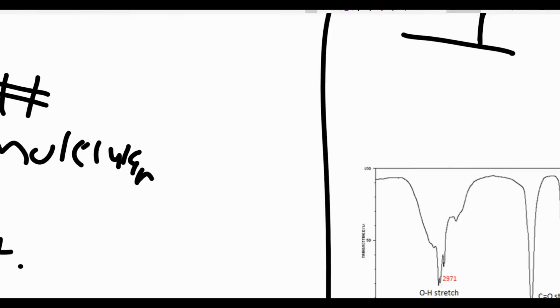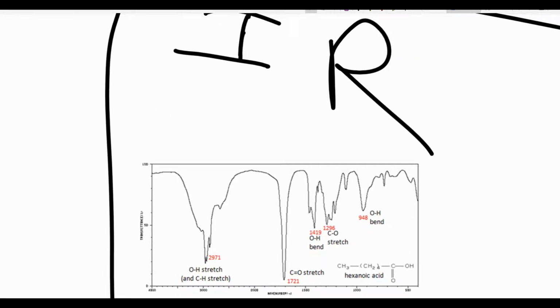Moving on to the next one, IR spectroscopy. This one I rated the ugliest because it's very different from the rest of the graphs. However, it does give you a lot of good, helpful information. As you can see, it's not based on parts per million, it's more based on frequency. So you need to start memorizing certain trends, like this one right here is going to be an OH trend because it's a really wide gap. If you memorize it, you use that in conjunction with either a carbon-13 NMR or a proton NMR in order to figure out the NMR question.